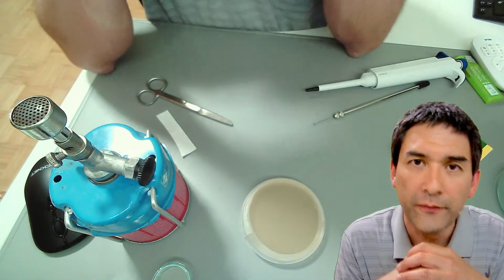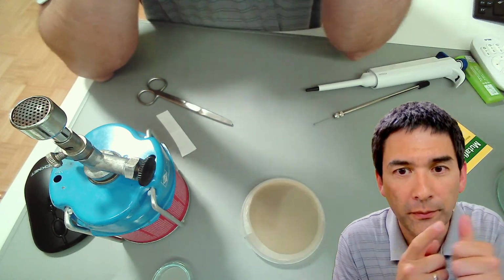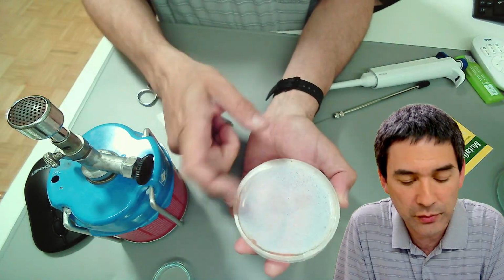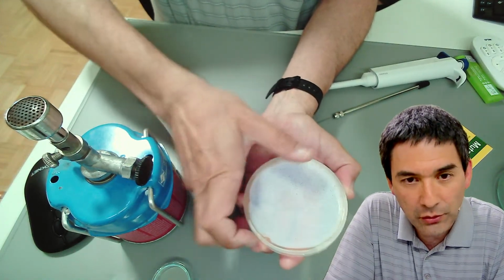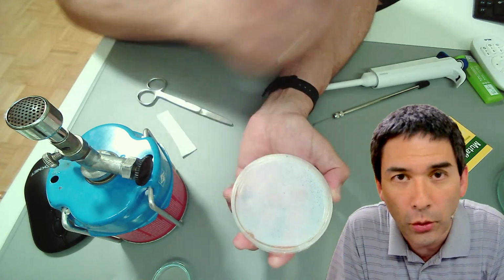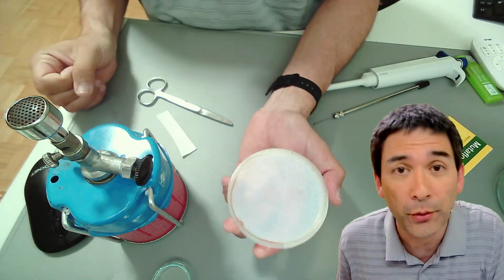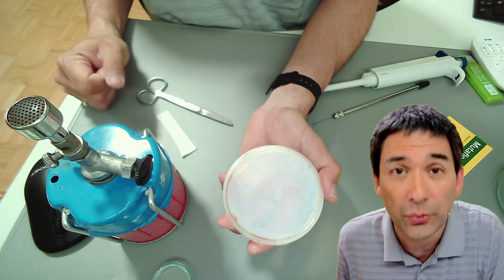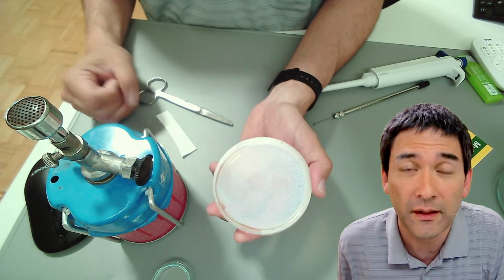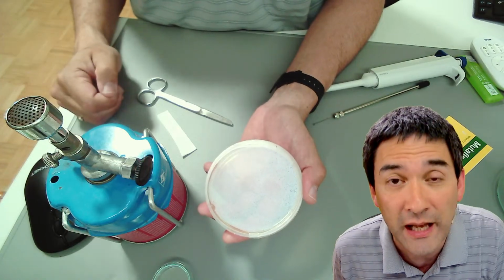On YouTube, you're able to find lots of videos where people grow their own bacteria from their fingers. They make those agar plates, and then, I'm not doing this right now because the lid is on, they press their finger on the agar plate. Then you wait a few days and you're going to see the bacterial colonies growing on here. This kind of shows how dirty your finger is. It's a very impressive little experiment, but I highly advise you not to do that. You do not want to grow bacteria at home that are able to grow on your skin. It's not safe. Then you're already in a higher safety biohazard category.